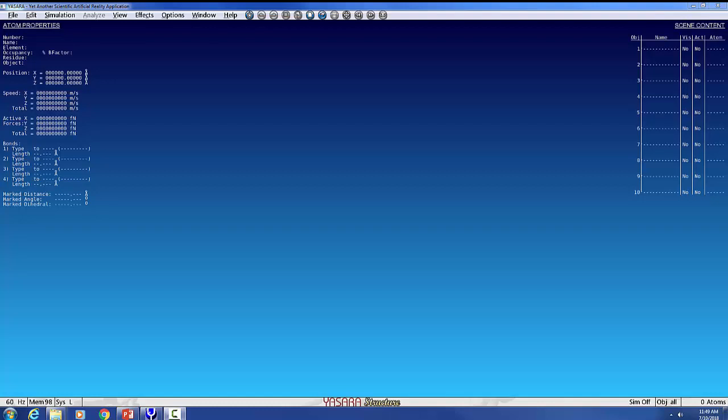All right, so this file is meant for a demonstration of the Yasara program that you will use to analyze protein structures. You'll get access to this Yasara program on either a server or one of the computers that we have here, but just as a reminder, this Yasara program is not meant to be copied, and so it needs to stay within the system.